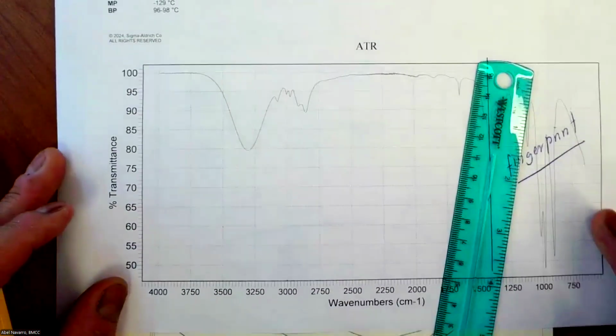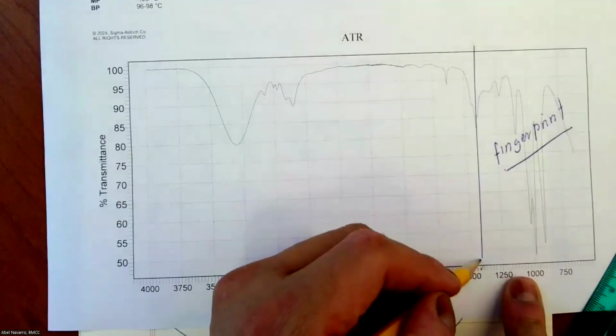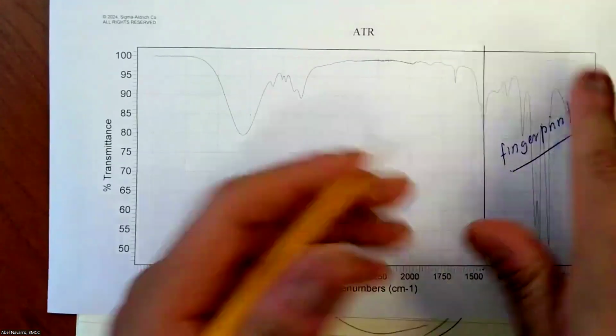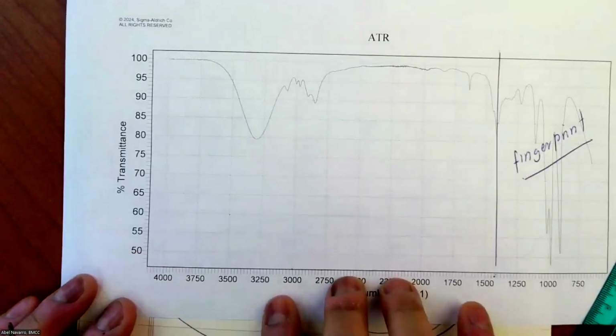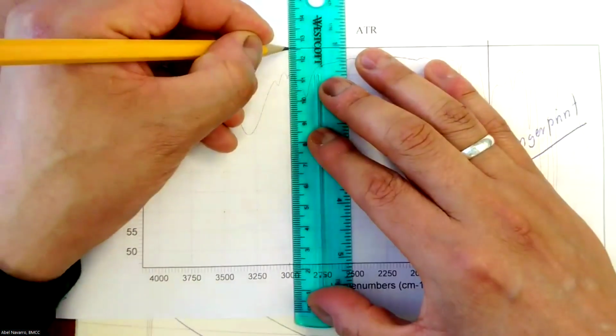All right, so let's do an analysis. The first thing to do is think of an imaginary line here for the fingerprint region. Forget about the fingerprint. We're going to be looking at the left side. So, the 3000 line: trace a line.